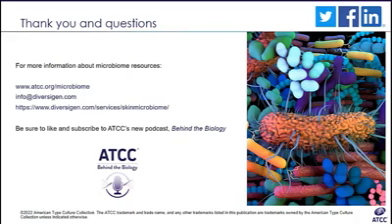Okay, good. Now, this next question is around experimental design. Would designing an in vitro experiment be helpful in identifying the skin pathogens? Can we use specific ATCC species and try to enrich the growth of these species, followed by identifying the gene expression?